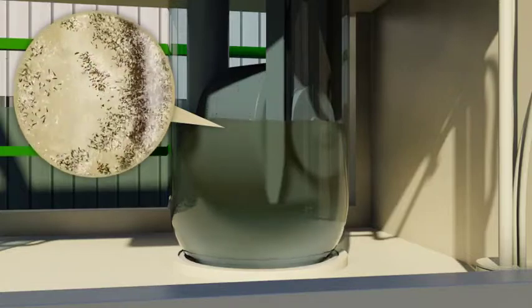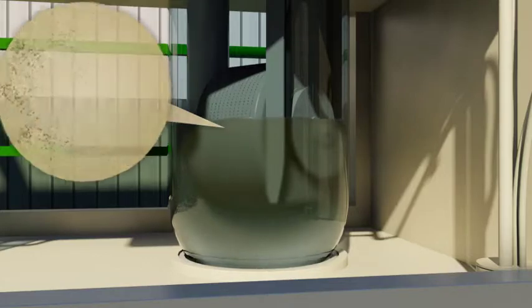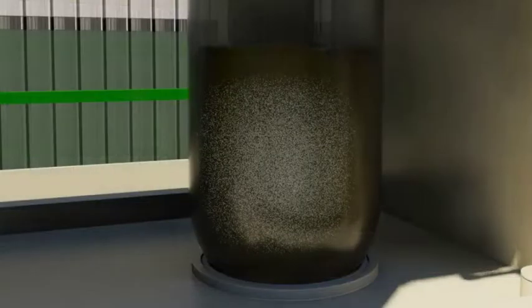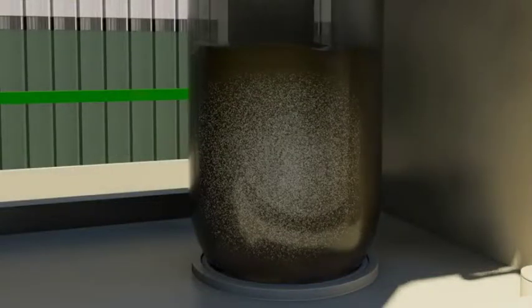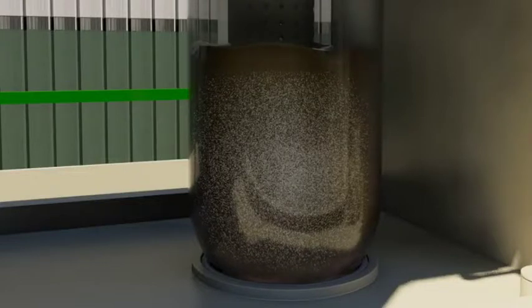There establishes a continuous equilibrium between silver chloride crystal formation, removal of the same, and exposure of fresh alloy surface to aqua regia mix acid. Due to this phenomenon, coupled with heat, alloys with higher silver content can be processed with better reaction efficiency in the shortest possible time. The completion of the reaction is visualized by accumulation of white silver chloride crystals and a changing color of the acid mix, wherein gold is dissolved.